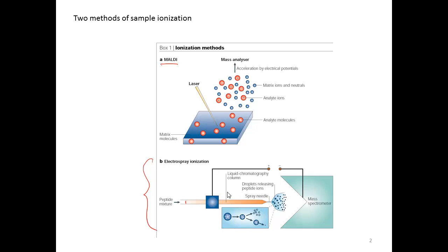Second thing is the solution in here is going to be very acidic. There will be lots of extra protons in this solution, so there'll be lots of positive charges. All the peptides will be positively charged, and there'll be a lot of free protons. Thirdly, we're going to put an electric field on the solution, again further increasing the amounts of positive charges that are present in the solution.